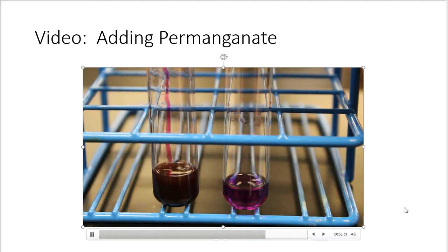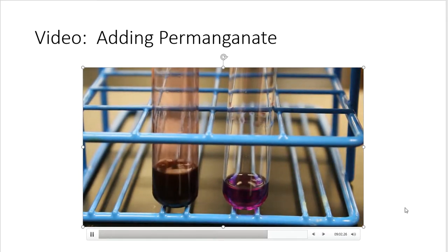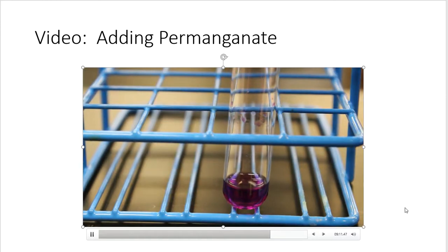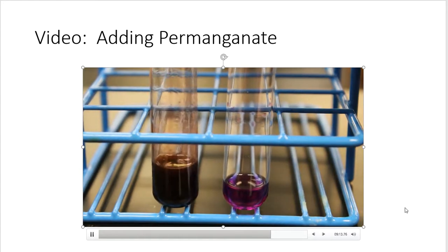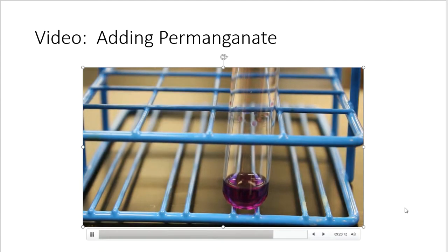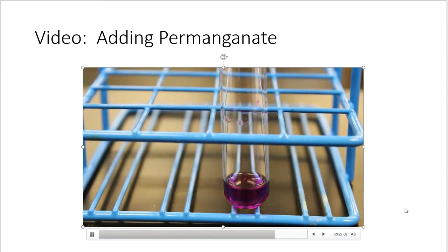6, 7, 8, 9, 10. Still kind of reddish. 11, 12, 13, 14, 15, 16, 17, 18, 19, and 20. And there you go. All right.